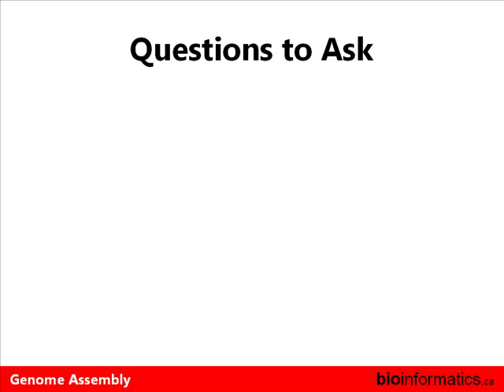So I guess to start with, all of you are here because you want to learn about handling next generation sequencing or high throughput sequencing data, and building genomes based on that. And there are some questions which you want to ask yourself before you actually go about doing this. And the first and the most important one is, what do you want to learn about the underlying genome? If you really want to get the whole genome from first base to last base, or if it gets a bacterial genome from first base to last base, assemble it using just high throughput sequencing, odds are you're out of luck. You will not be able to do this.